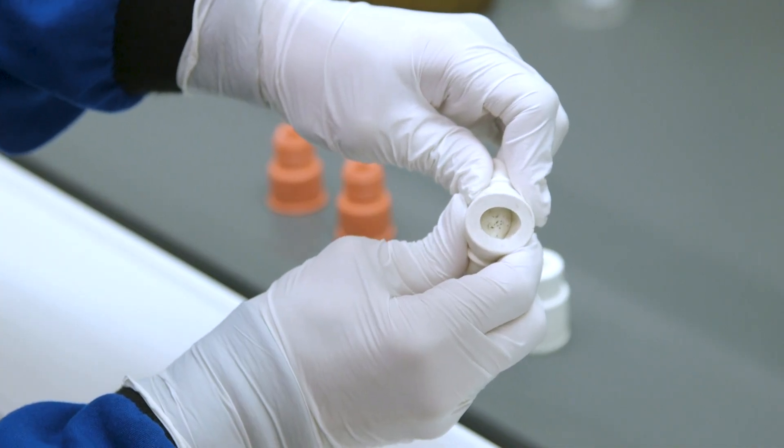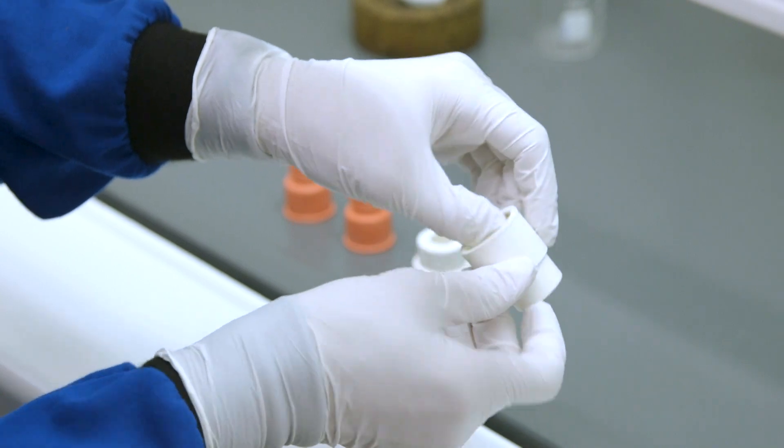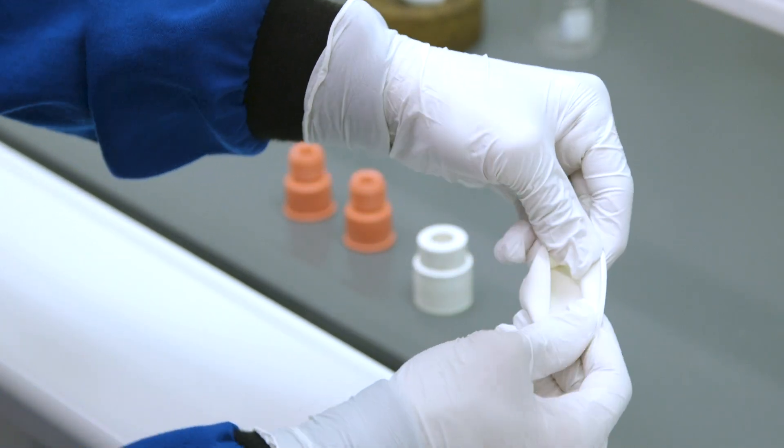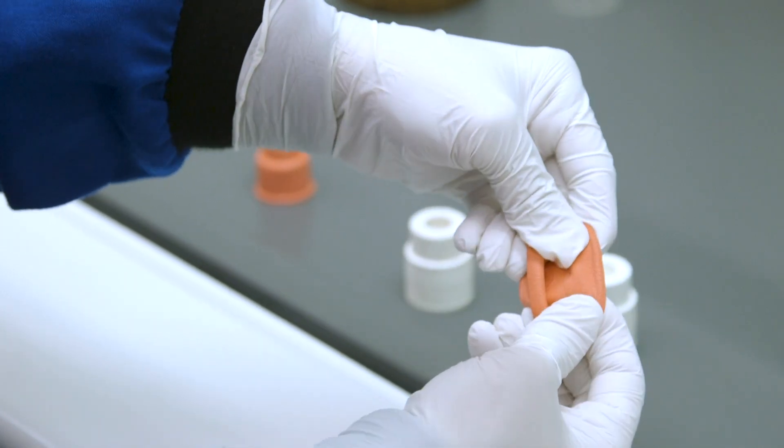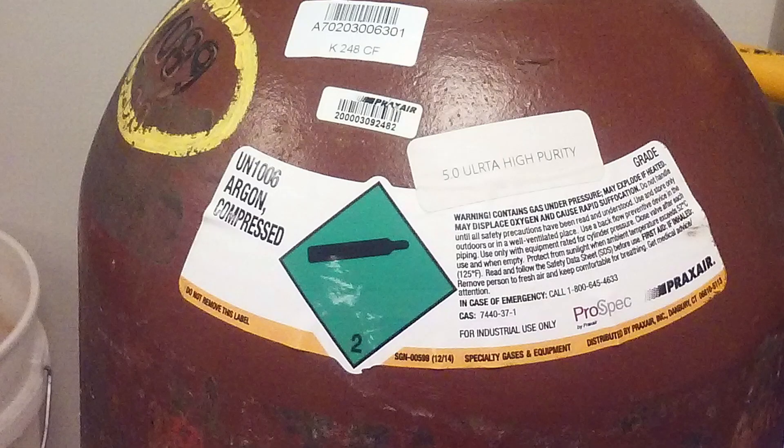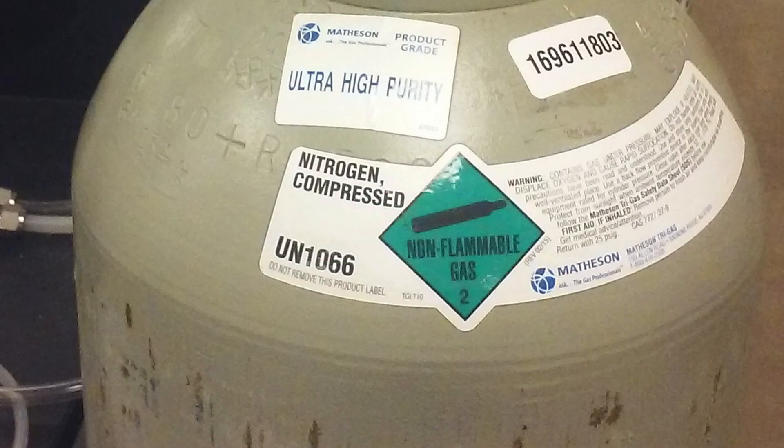During assembly, all joints are greased to ensure a tight seal wherever ground glass to glass connections are made. Rubber septa or stoppers are installed on any openings to the system. The system should then be cooled by flushing with dry argon and drawing vacuum down for at least three cycles. Argon is the preferred choice as it is heavier than air. If argon is unavailable, nitrogen can be used.